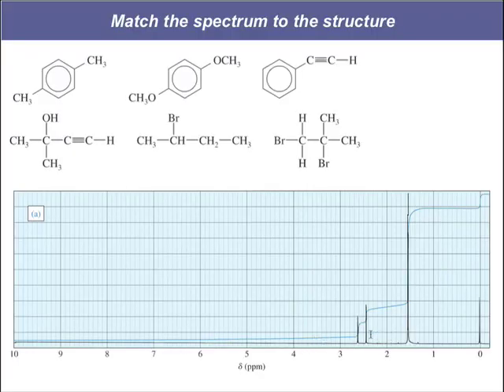We've got something right at 2.5, smack dab between 2 and 3 ppm. That is our acetylenylic hydrogen. So this peak right there is our acetylenylic hydrogen. That's 1. Our higher shift then must be our alcohol. Remember, the alcohol can show up between 2 and 5. And since this one's right at 2.5, that's a good guess for our acetylene. That leaves this other peak for our alcohol.